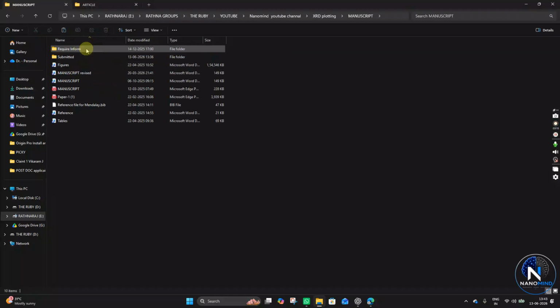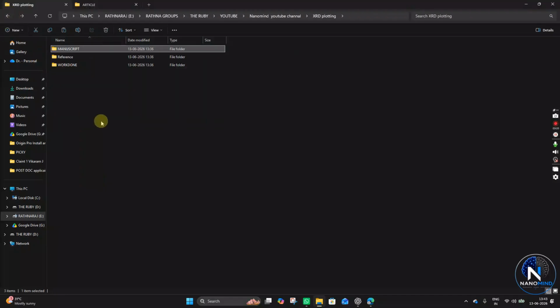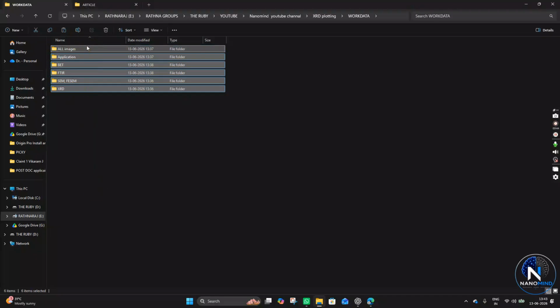Here in manuscript, we have some of the files that I mentioned in previous videos. You can go and check what I explained. Now today, in work data, I mentioned that all the analysis and application data would be saved in this folder only, right?